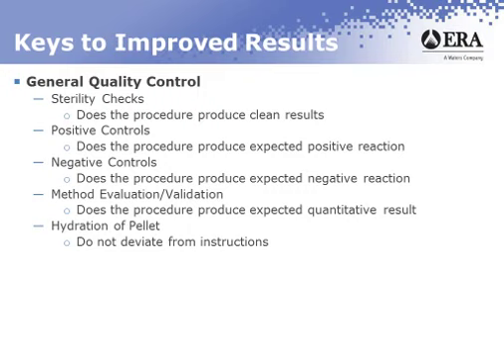So you definitely have to be somewhere beyond 30 minutes before that becomes a concern, but it is potentially a concern. Don't rehydrate your sample and then go out to lunch and then come back and cross your fingers. It's an area where you need to follow the instructions.